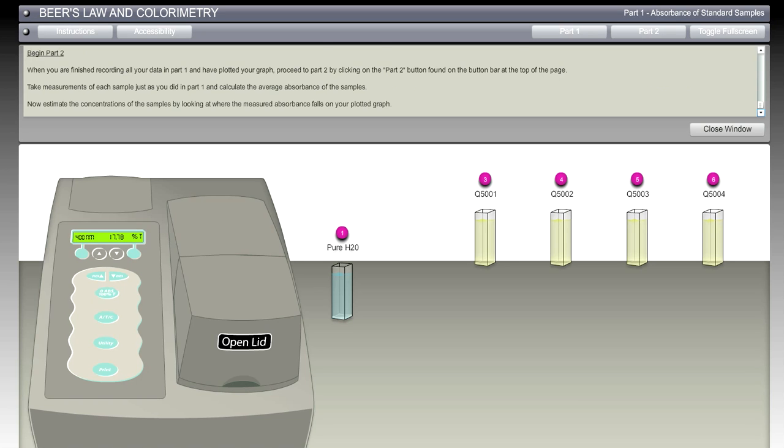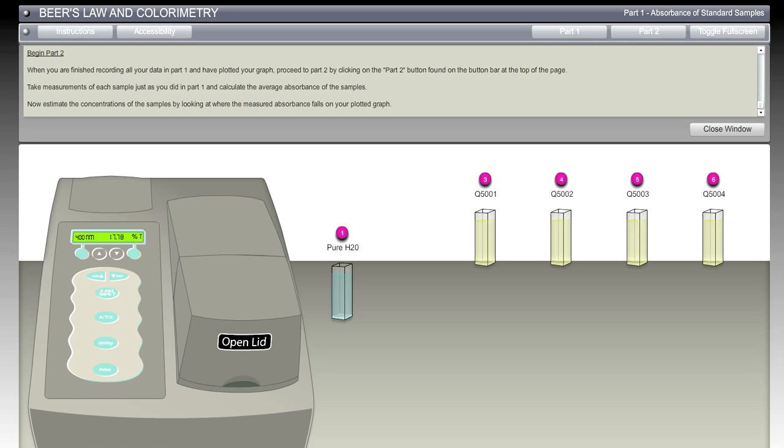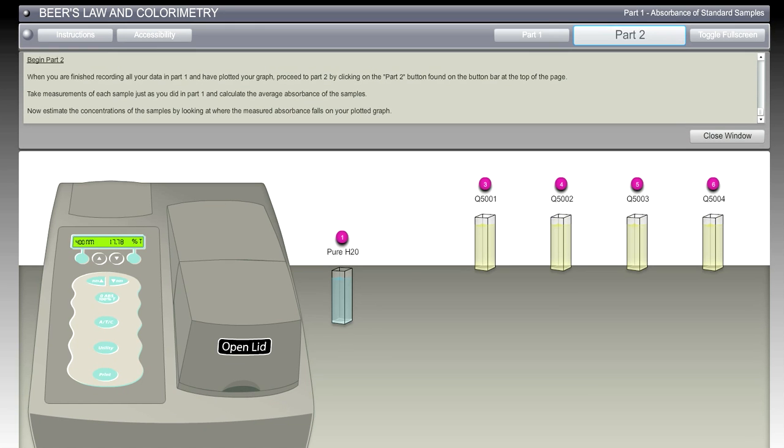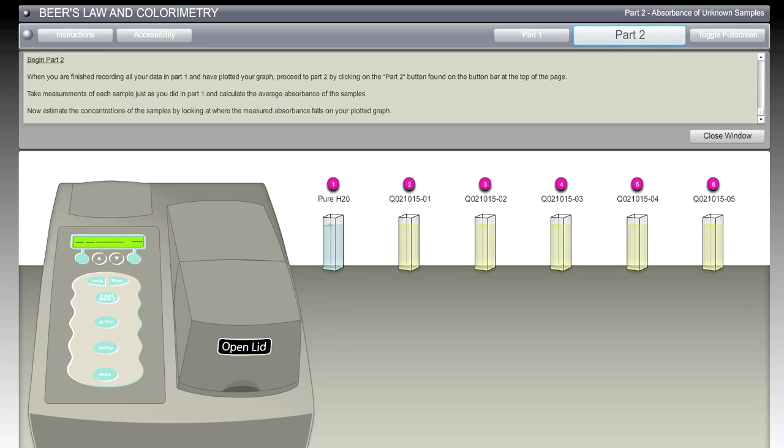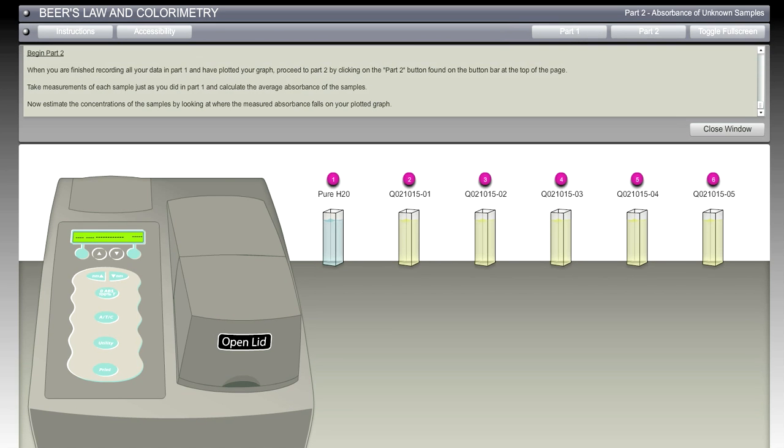So now we're going to begin Part 2. When you're finished recording all your data in Part 1 and have plotted your graph, proceed to Part 2 by clicking on the Part 2 button. Let's pretend that all these cuvette vials have been read through the spectrophotometer. I'm going to hit Part 2 now. We'll get a new set of samples and we're going to take measurements of these samples, just as we did in Part 1, and calculate the average absorbances.